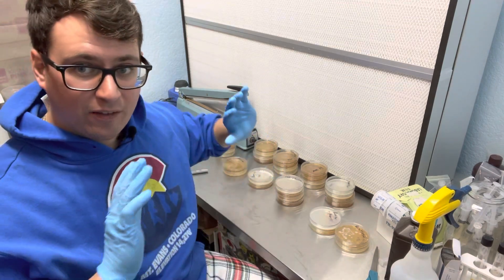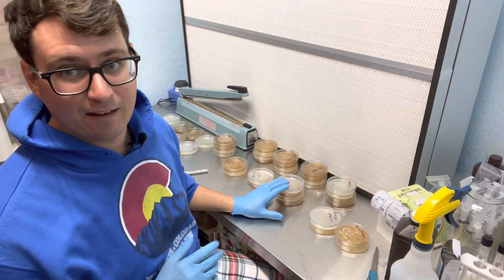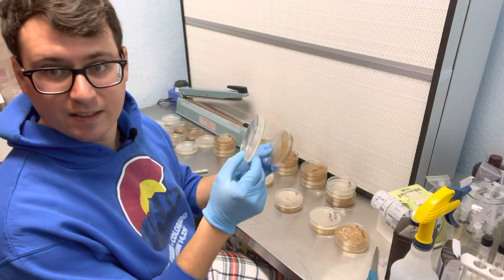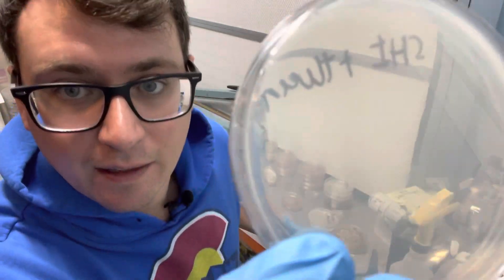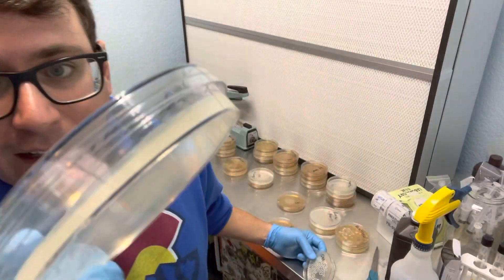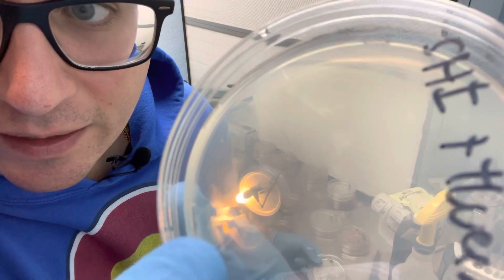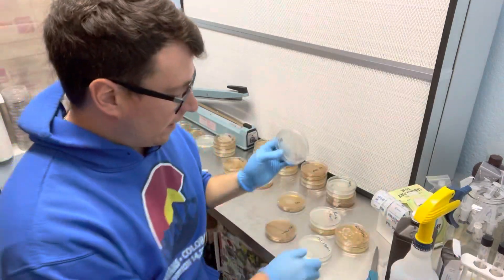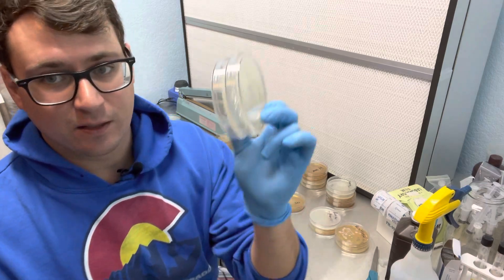So it's five days in. We've got some oyster mushrooms popping. We've got some folio to namiko and also some shiitake, very early stage. I'll go through and start off with the shiitake, which you can definitely see the difference on the tween plates. You can see one colony forming, and it's really hard to show on this dish, but there are probably a dozen or so tiny little colonies that have just started on the tween plate. This is the PDA plate and there's no growth yet, but I have no doubt that if we got some colonies forming on this — maybe in a day or two — we'll start to see some shiitake. So that is very early.